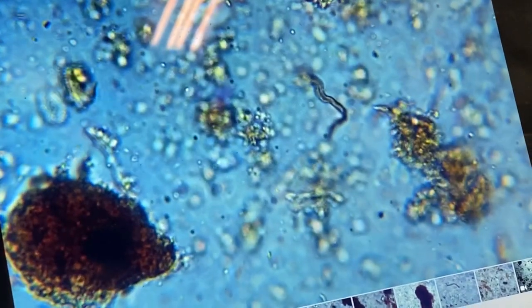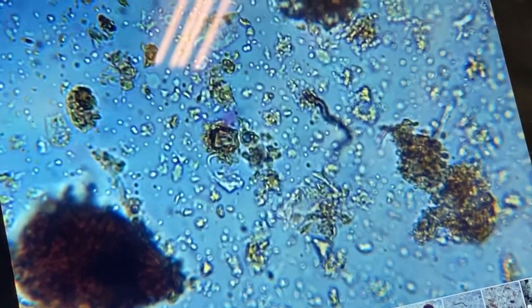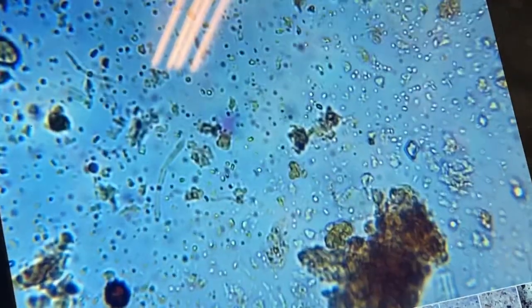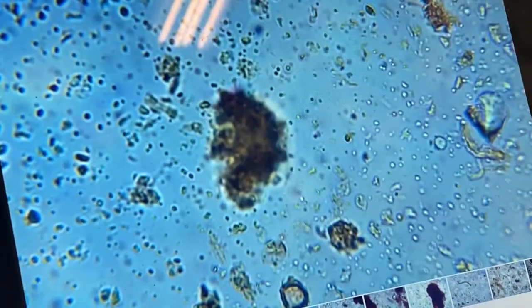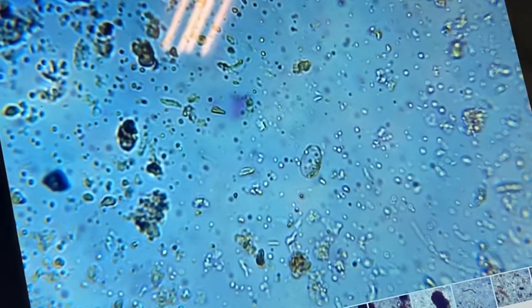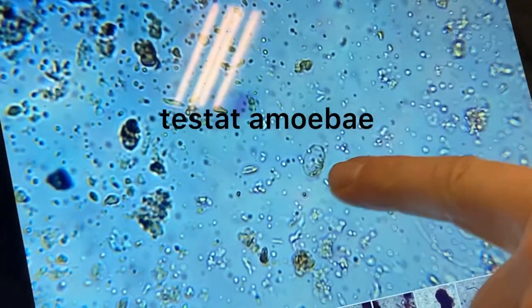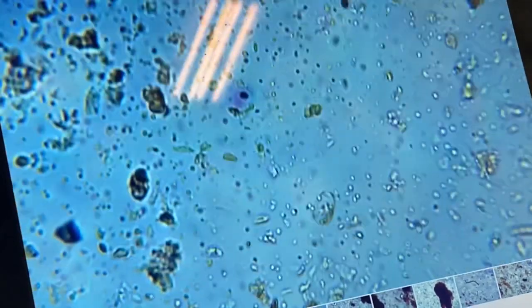We cut the volume out because it was just too loud. I asked Zach: for a Johnson-Su compost that is 10 months old, should we be seeing more fungus? He said yes. The reason we're not is largely a function of it going anaerobic. Even though it fixed itself and is no longer anaerobic, the end result was a higher bacteria-dominant compost rather than a fungally dominant compost — but still compost we can use to stimulate the seed and soil for our farming operation.